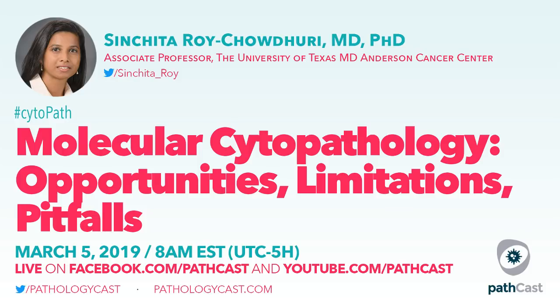The best yield we've had for making cell blocks is the collodion bag technique, which tends to be a little labor intensive, but if we see tiny fragments in the rinse that we're worried will not survive the cell block preparation, we will use the collodion bag. It takes a little bit more effort, but it usually ends up getting you a much better result.